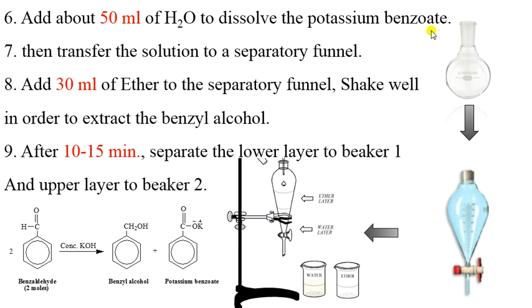The salt will dissolve in water. Then transfer the solution, benzyl alcohol, potassium benzoate, maybe other impurities, with H2O, to the separatory funnel.